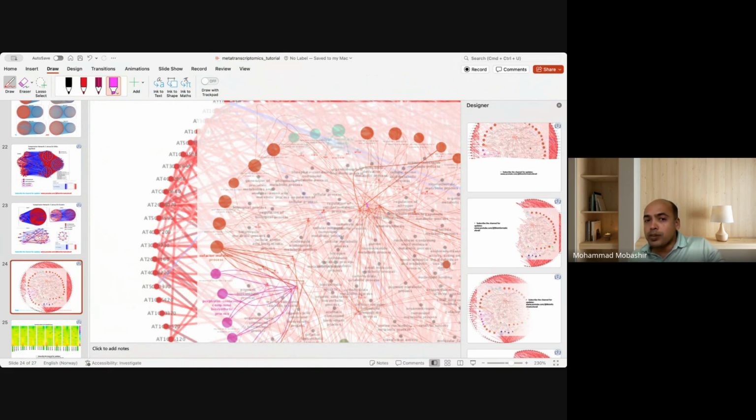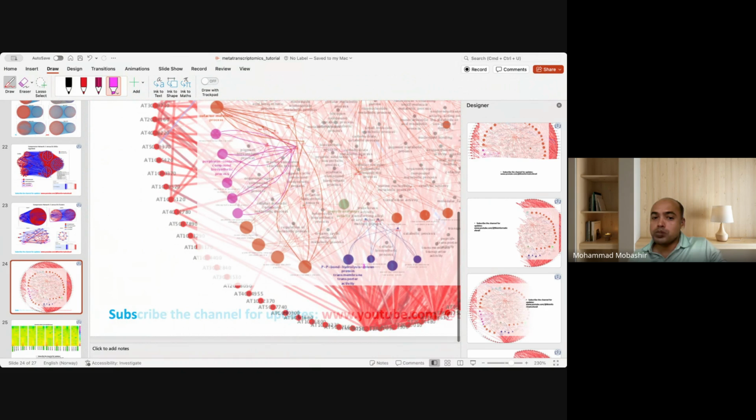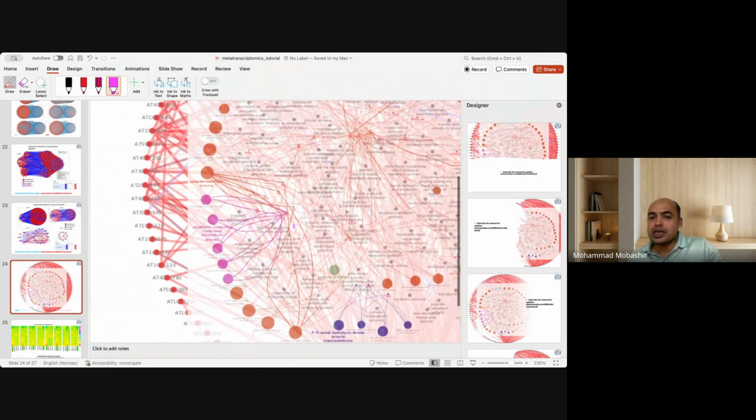So this could be opposite, but you need to see the videos properly. For example, in this case, it is opposite. These small nodes have higher connectivities. That means they are more significant. And bigger nodes are having lesser connectivity. That means these genes are less significant. Or if we are talking about pathways, then the same thing applies for the pathways.